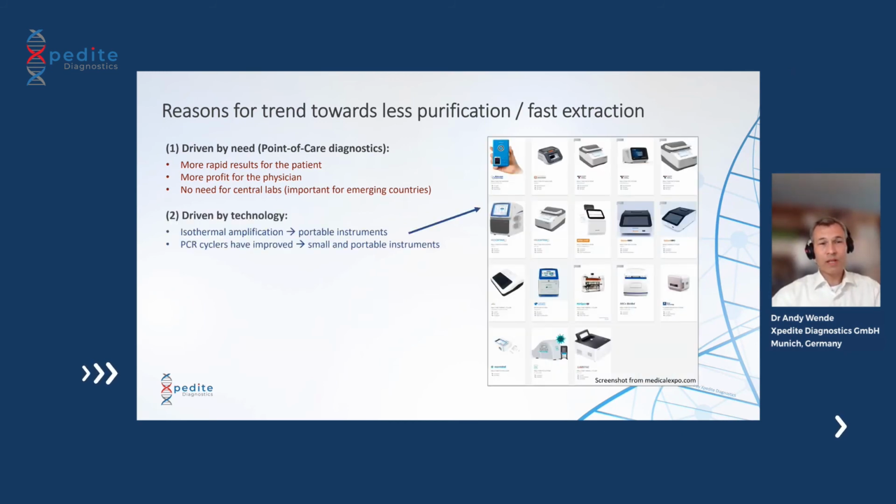Second driver is indeed the technology. In the last 20 years, we saw that instruments like PCR cyclers or instruments for isothermal amplification became smaller and smaller, much more energy efficient, and also the amplification became shorter and shorter.